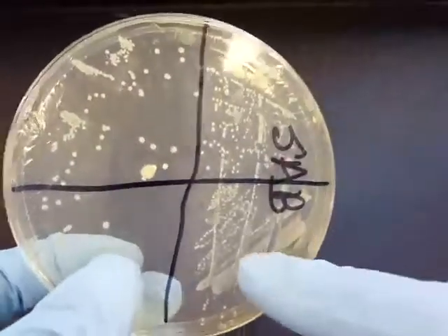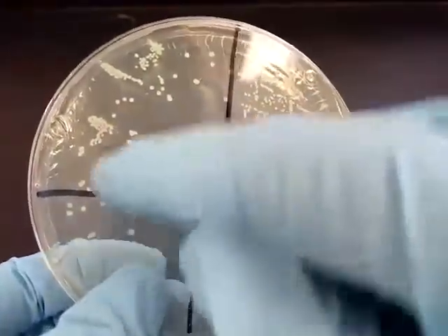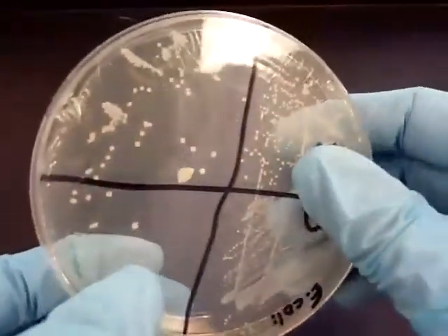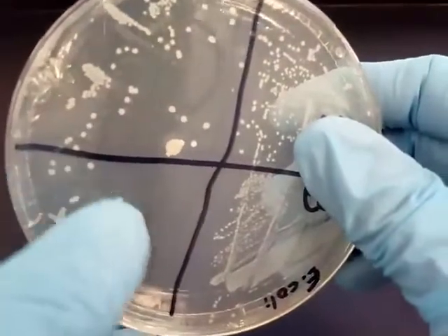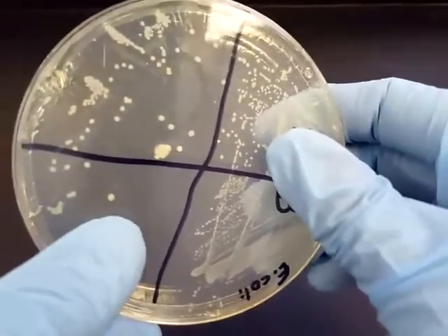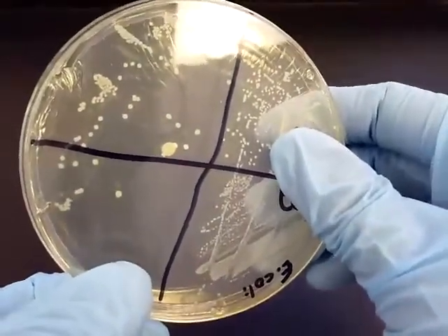So you can see big cluster, smaller cluster, and here's where we can start evaluating individual colonies. Anytime we want to do a workup on a microorganism, we're going to want to work up a single colony, and that's what we can run all of our tests on. So we would take our loop and we would scrape off that one colony and do some follow-up work on that one colony.